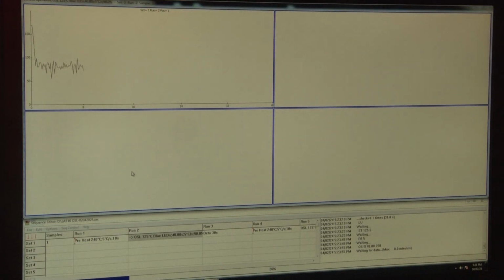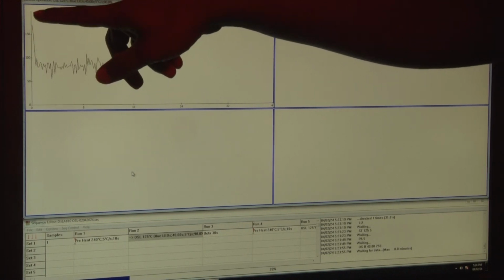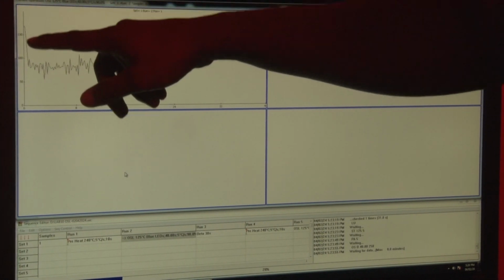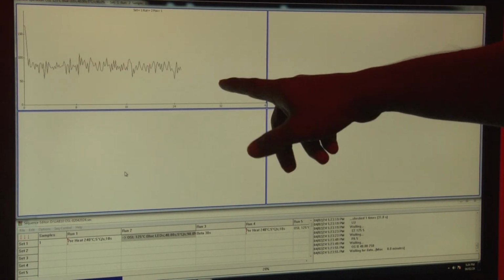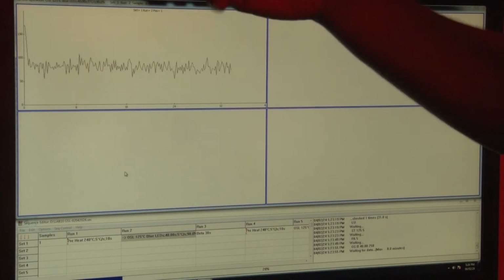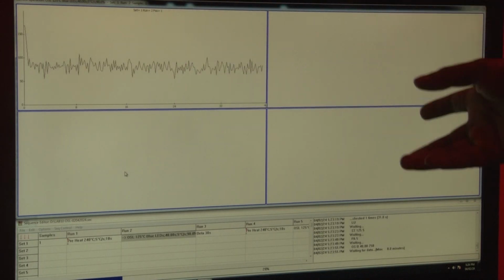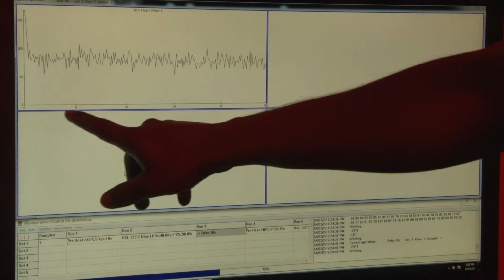As soon as the sample is exposed to the blue light in the OSL part, in 1 or 2 seconds all your stored electrons are emptied. So you would see a curve like this, and in the case of feldspar, you will see a gentle decay curve. This decay curve and the growth curve we have discussed in the earlier theory part, so you can follow that class. In this sample, this is the photon count, and this is the time.